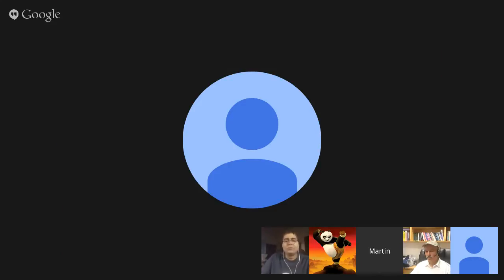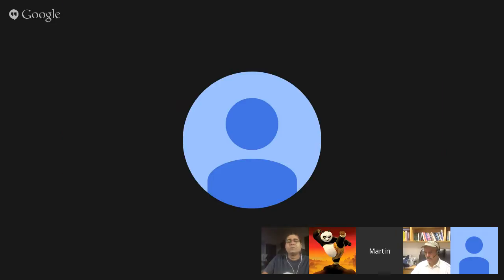So what I'm going to do now is switch to my computer screen so I can demonstrate a few steps that you will have to go through in order to connect to the database and so forth. You don't really need to take any notes, because I'm going to upload this video later, and you can just watch it on YouTube again, and it might be easier to just follow along. Okay, so I'm going to share my screen now.